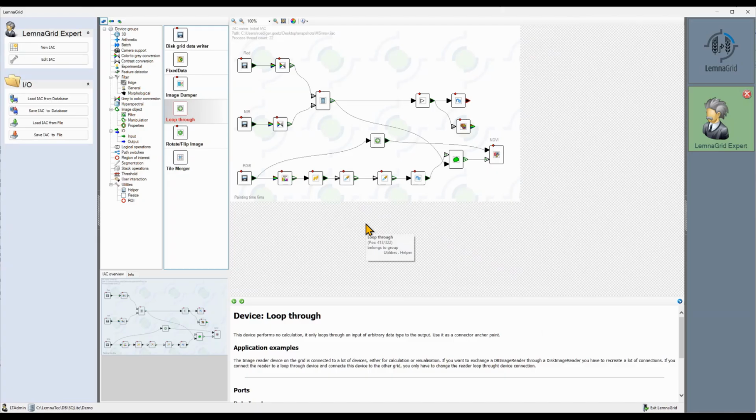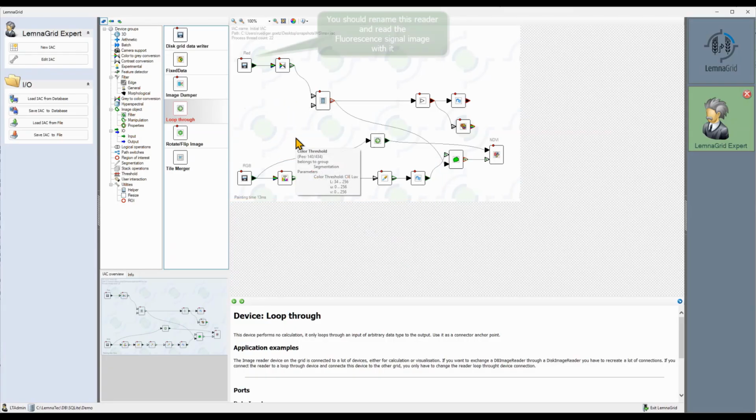If we want to measure some fluorescence signal, like the chlorophyll fluorescence, it's even simpler. We may use the same channel for segmentation, in this case RGB. We need just one of the other readers and input to the one main reader the image which was recorded using the correct filter. We can omit the gray calculator and the amplifications.